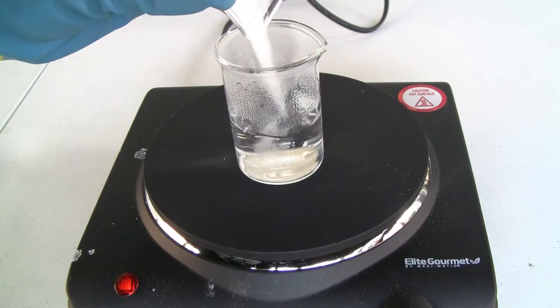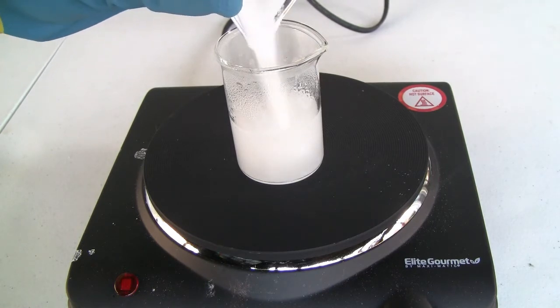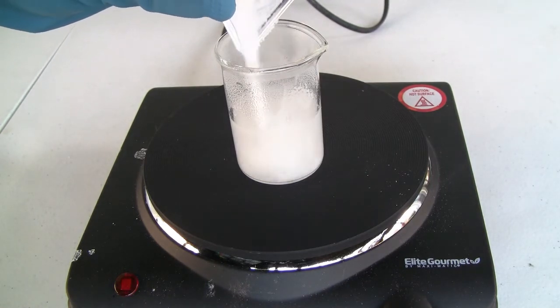I started by bringing 45 milliliters of distilled water to a boil. Once at a boil, the borax is added and stirred.